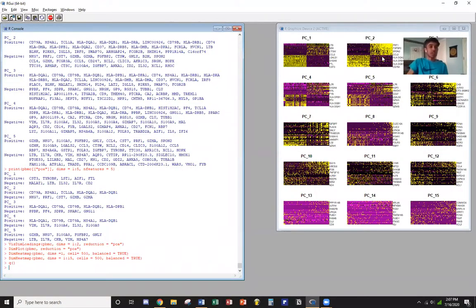Okay, so great. Welcome to part three of our tutorial with Seurat. Now we will be determining the dimensionality of the data set. Next we'll be using a function called JackStraw plot. This function provides a visualization tool to compare the p-values for each PC with the dashed line, also known as a uniform distribution.